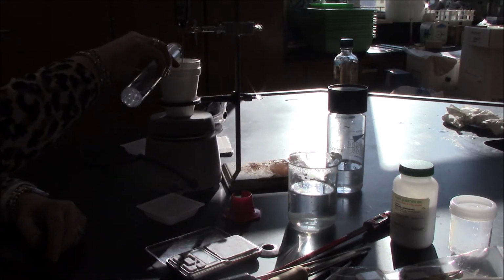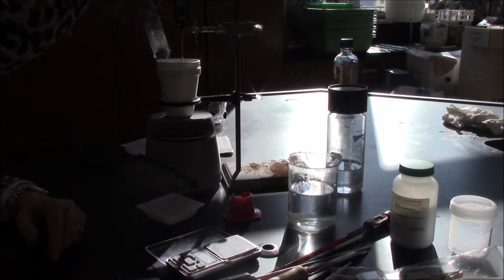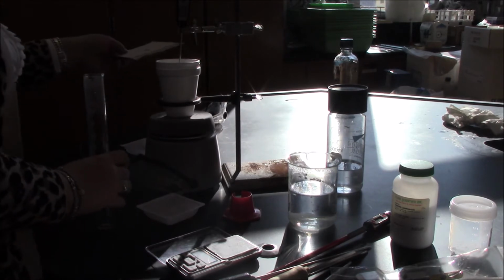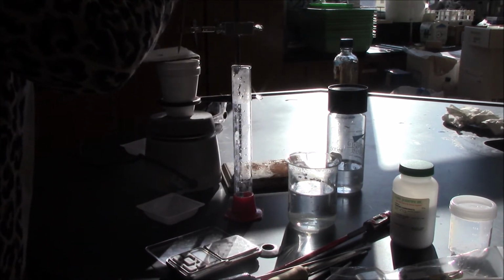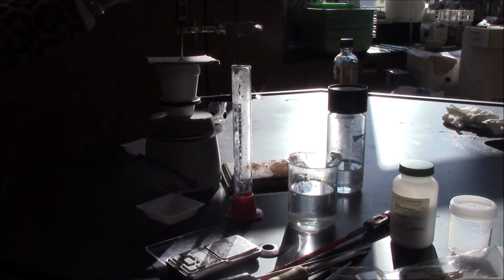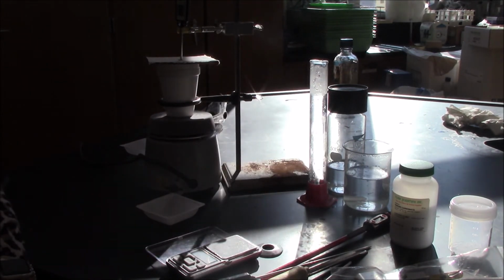And now what I'm going to do is combine the two and allow them to equilibrate in temperature. Oh, I wasn't expecting that. Put my lid back on. And I'm going to watch the temperature change. The temperature is continuing to increase, but it shouldn't take long for it to equilibrate.